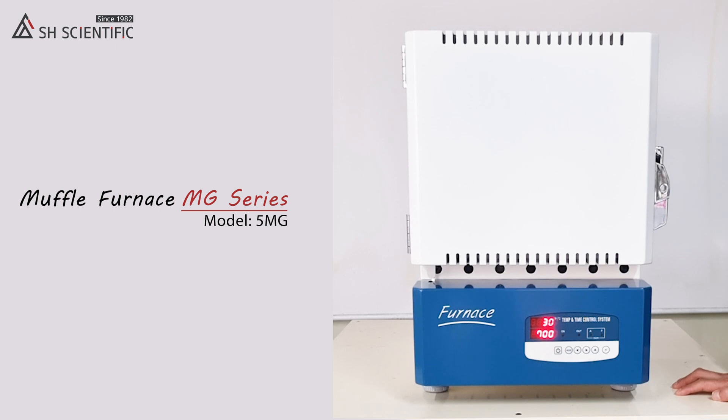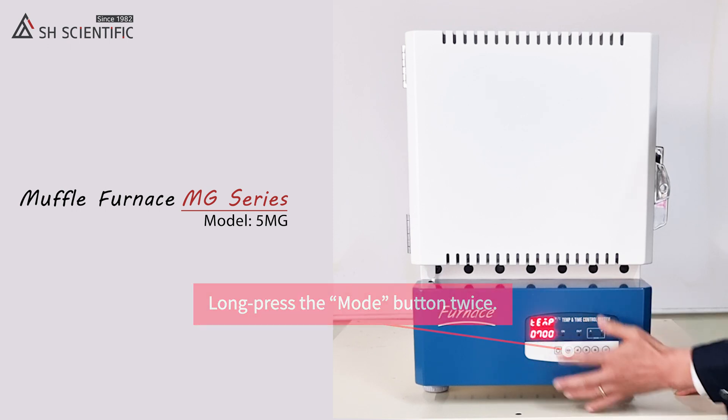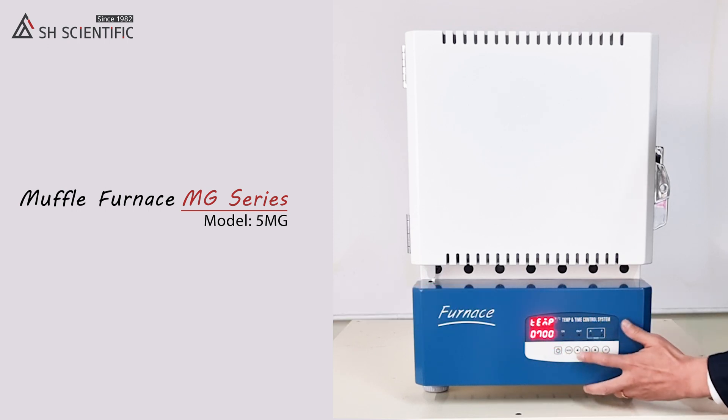Now we're ready to set the time and temperature. To enter the temperature settings, press the mode button twice. Then set your temperature like this. I'm choosing 700 degrees Celsius for now.